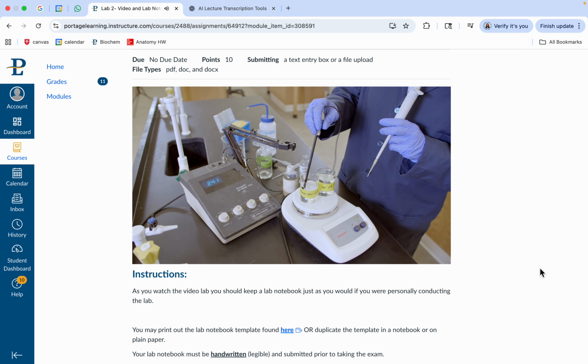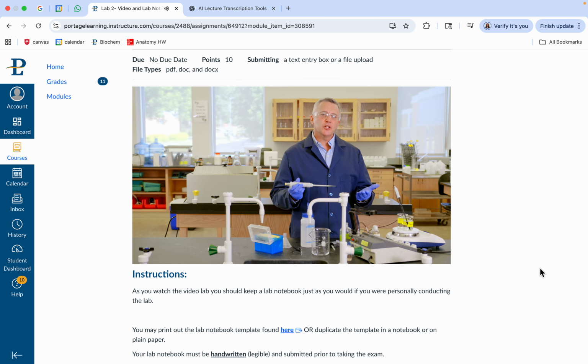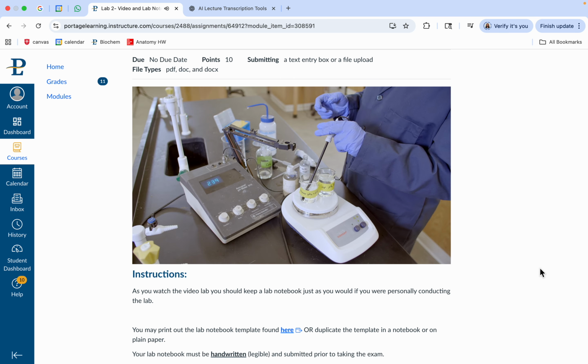I'll add another bit of alkali to help demonstrate this. Stir it up, and again, it goes up briefly to 2.41, 2.4. It is going in the correct direction. That is going up, which is what we expect. But again, it's resisting the pH change, which is really the goal of a buffer. So we've gone up to about 2.4.